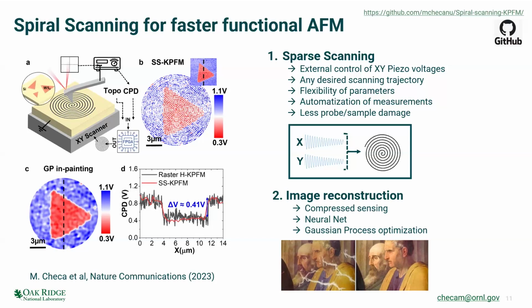So in terms of scaling, one could think of an array of tips and then some sort of continuous scanning with different biases applied and different trajectories. I showed this application as in, we can automate the process a lot and we can control our microscopes very well. However, I do think that this method is very good more from the fundamental physics standpoint of understanding what is the switching mechanism in there, what's going on actually in the energy landscape of this material. The final application is still too early.